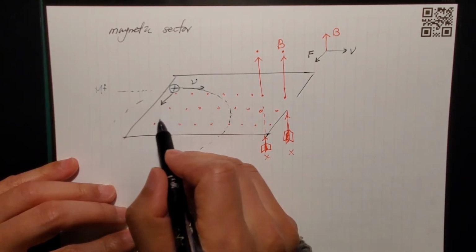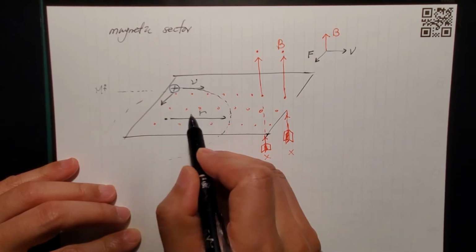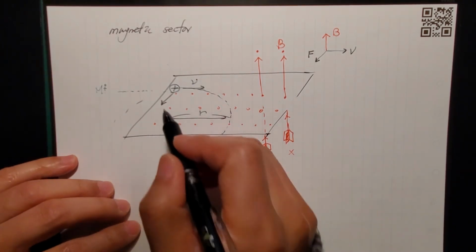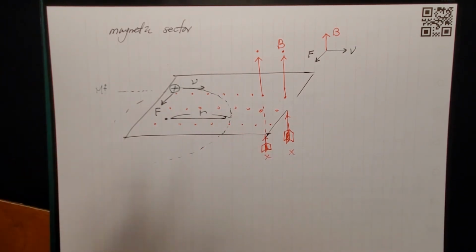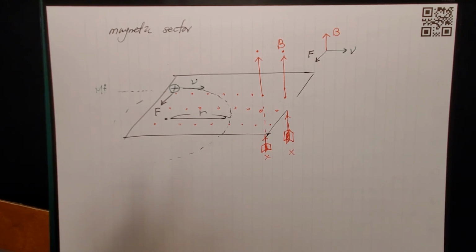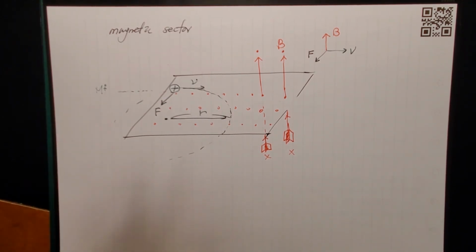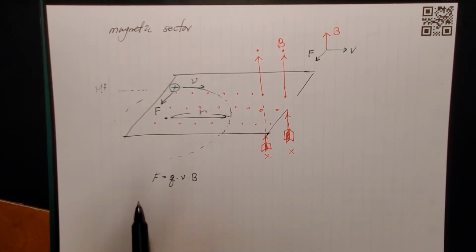With a certain diameter. The center is here, and that was R, for example. Then the force given to the charged particle by the magnetic field, in conjunction with the speed given by the accelerator of the machine, will be this much, like we said in previous videos, okay?